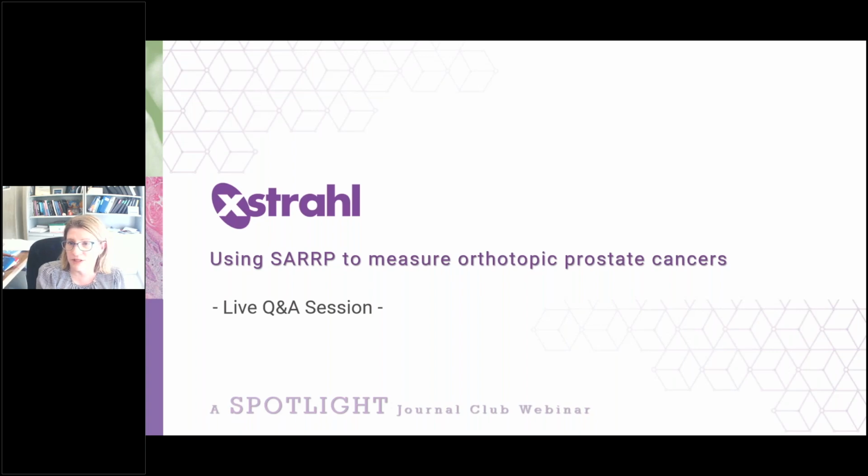And it just depends. A lot of our animal models are also genetic models, where the tumor is just developing on its own. You don't have a way to really monitor that using the IVIS instrument, because those cells are not expressing luciferase in general. And so I think this would also be a good way to monitor that over time, in a GEM model where mice spontaneously develop these tumors over time. You could probably see that with this imaging modality as well.